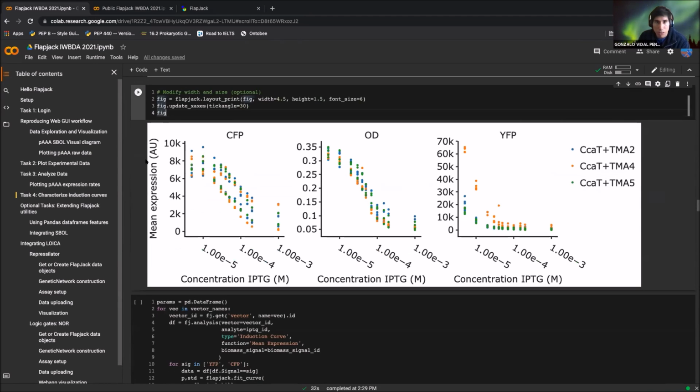Then let me see some chat now. So, trying to follow the notebook in Colab, what do you expect in continuity drive, my drive, Loica? Nothing, it is just one folder that I select to have the notebook running. So if you choose any folder on your drive, it will be okay. Even if you don't select one, because it will be the base.